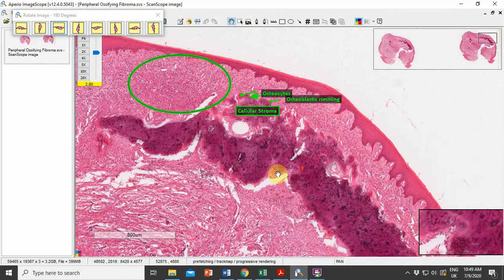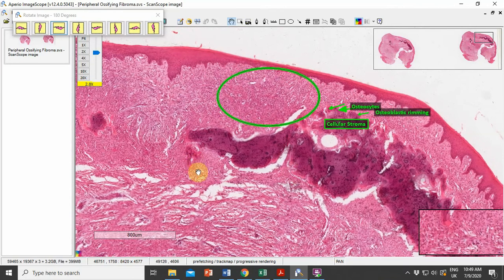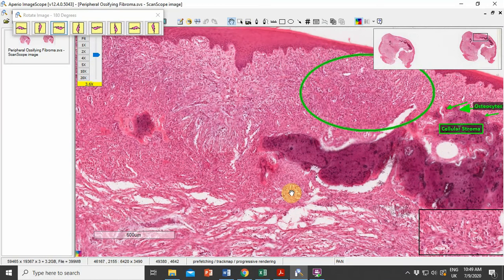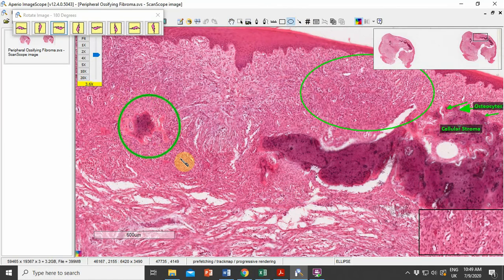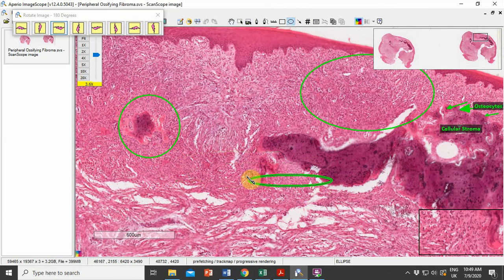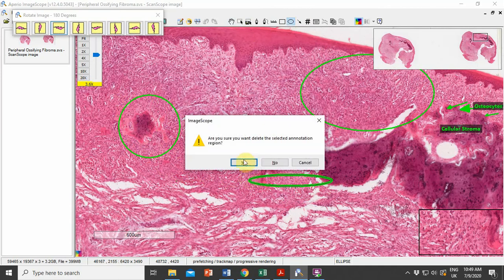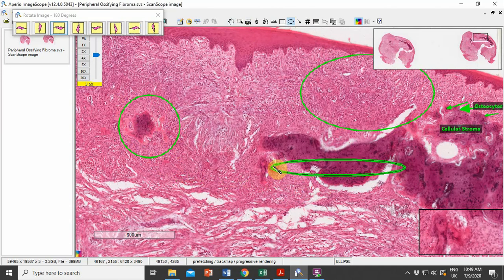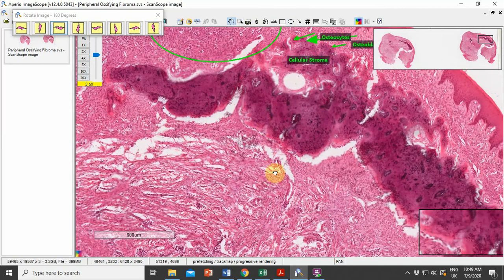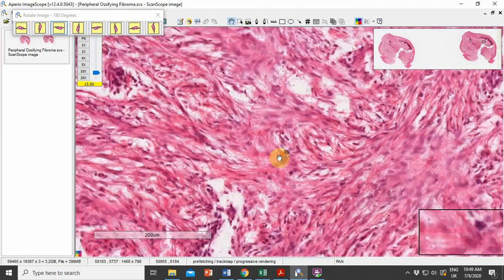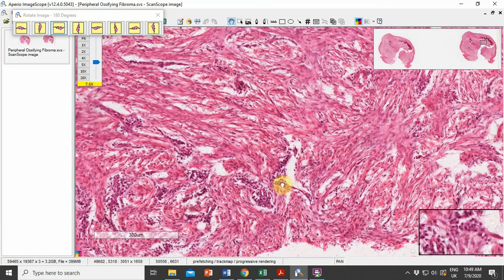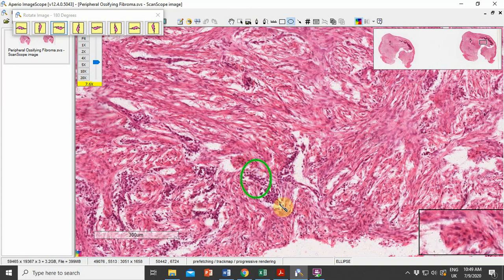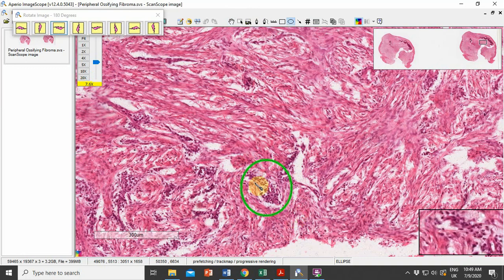Now we can see the remaining part of the slide. There is a smaller area of mineralization here, while the bulk of the mineralization is towards the other side. The lower part of the connective tissue is densely fibrous, with a few scattered areas of inflammatory cell infiltration.